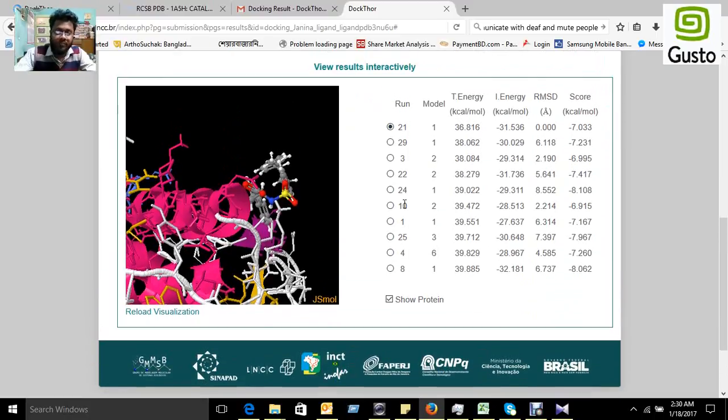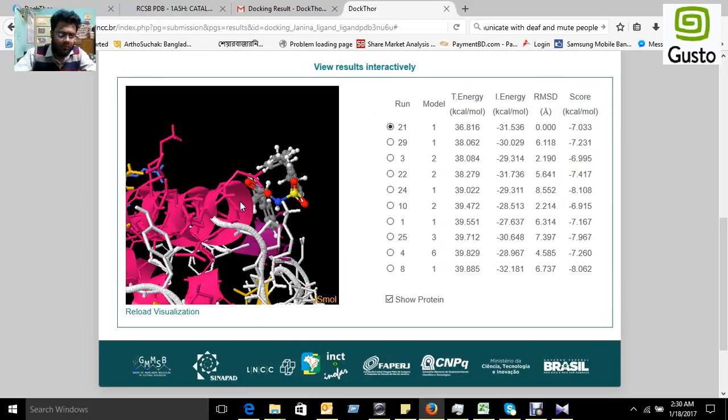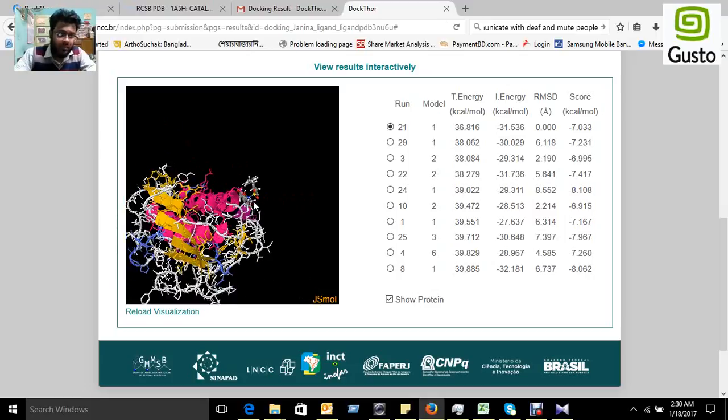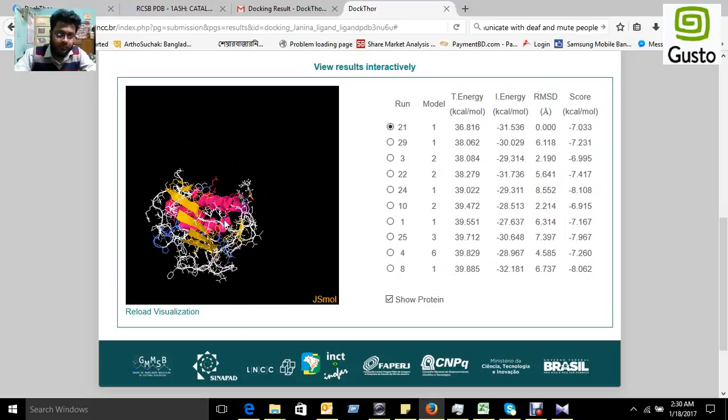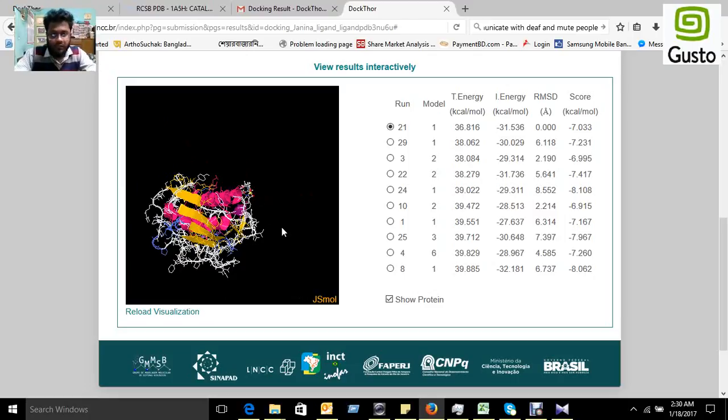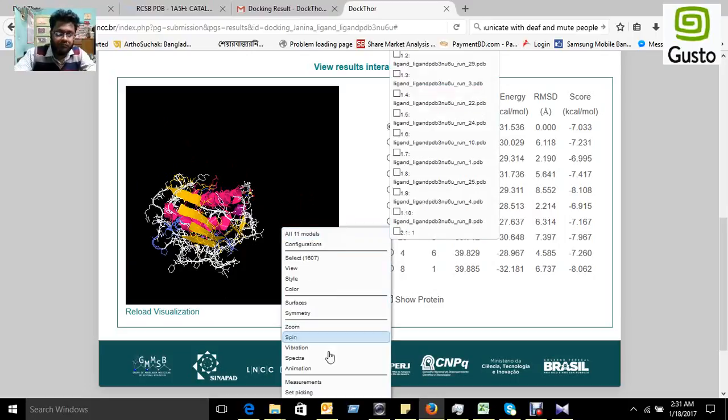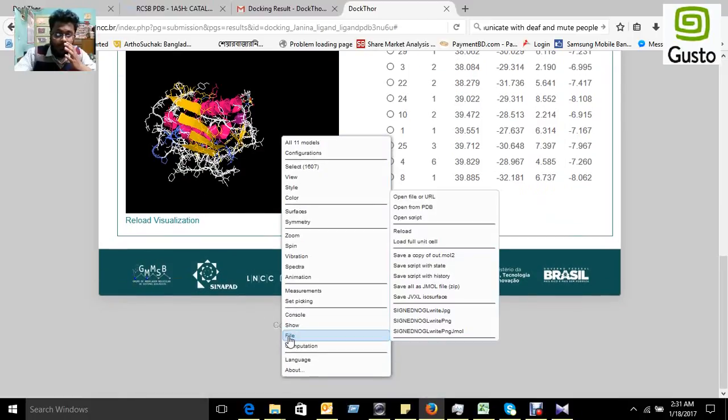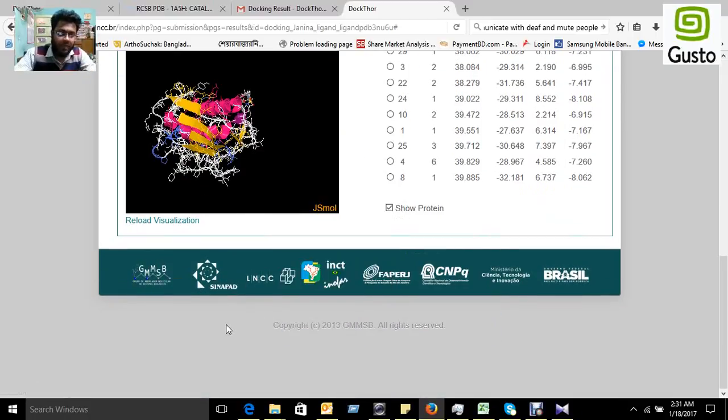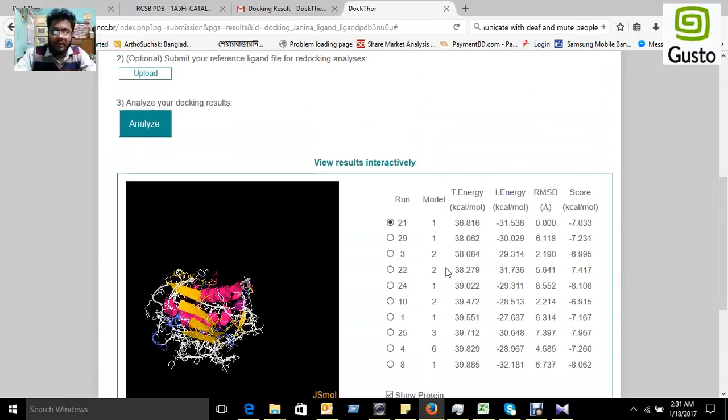Also, you can zoom it and you can reduce the structure also, and you can move also because it is a 3D structure. You can export it from the result. From the file, you can export the JPG and other type of figure. If you want to download the data or result, you can download it from that part.